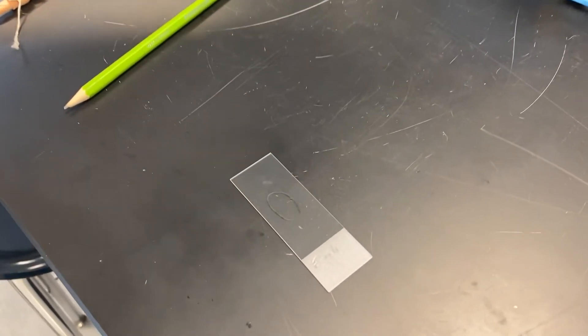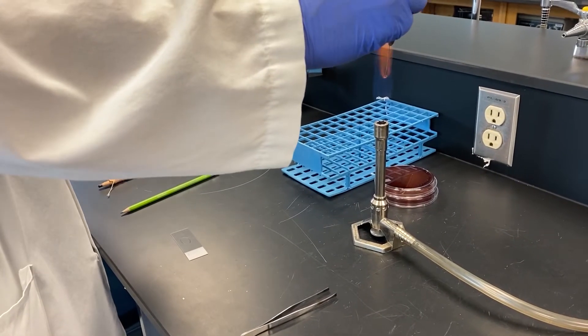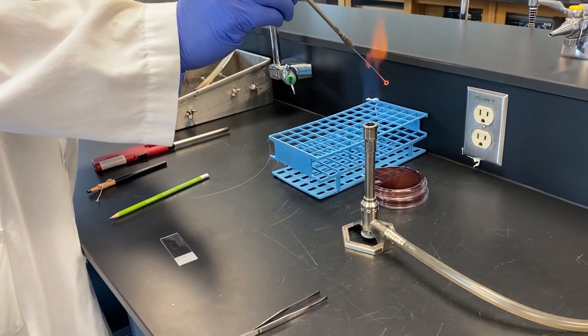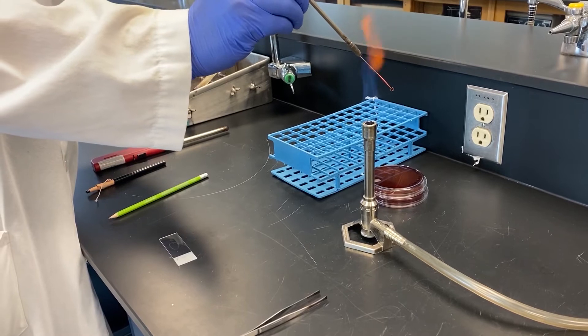Now we need to take the broth culture of bacteria and put it onto the slide. To do that we will use a metal loop. The first thing you need to do is sterilize the metal loop using your flame from your Bunsen burner. It's really important that you flame the entire loop from the top to the bottom until it's red hot.